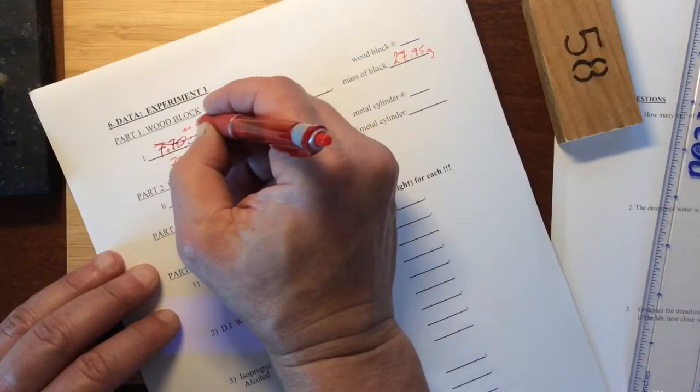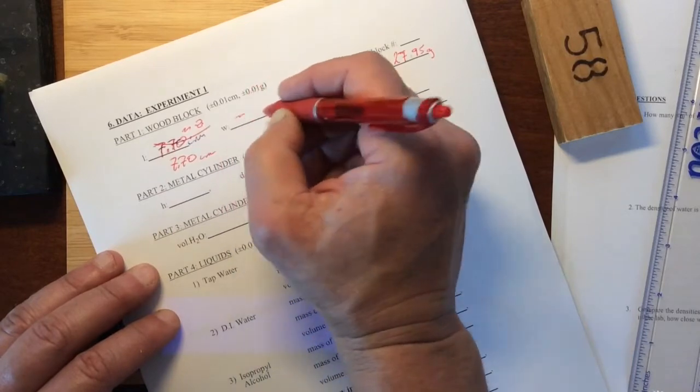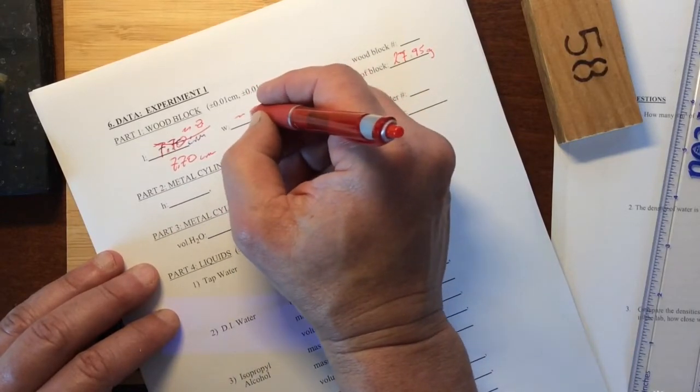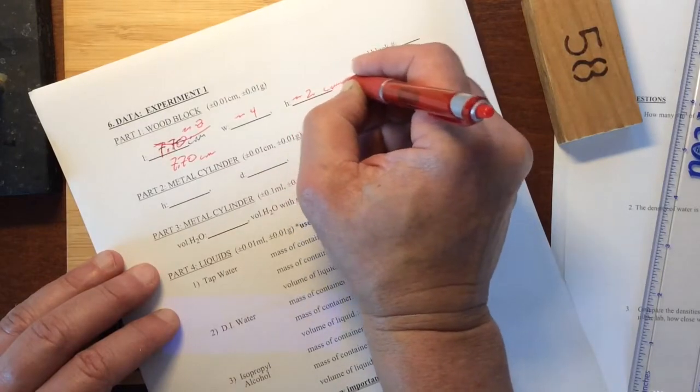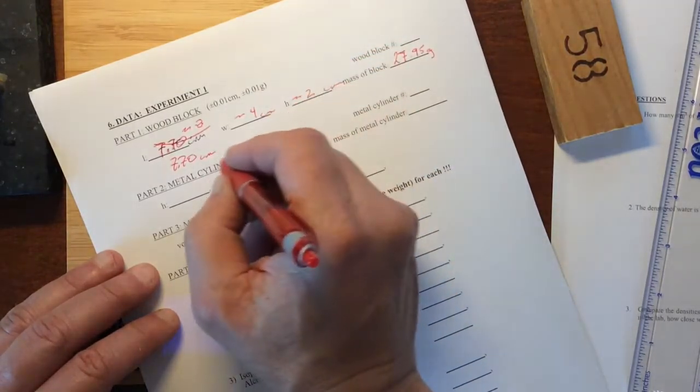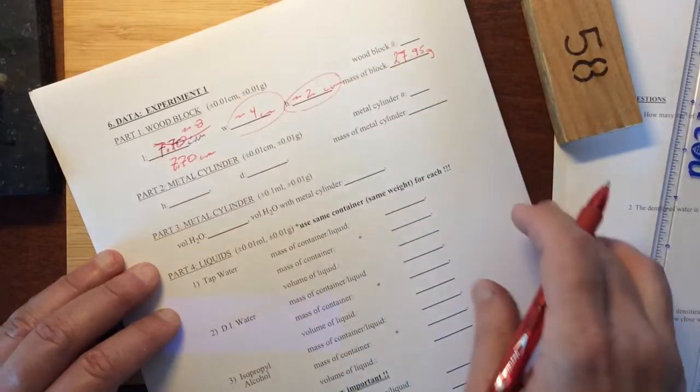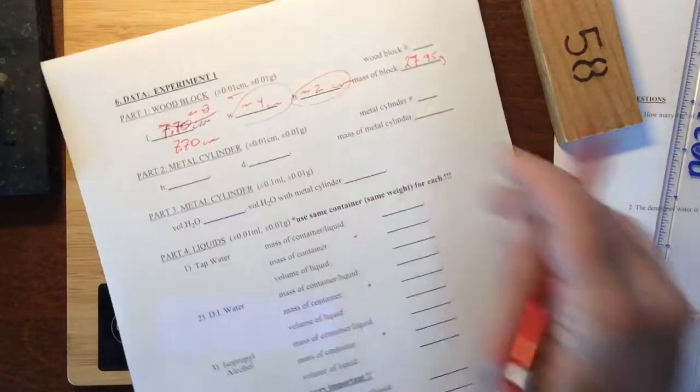We had something that was a little less than 8 here, something that was a little less than 4, and something that was a little less than 2. Your numbers should be the actual red values written out to the hundredth place.